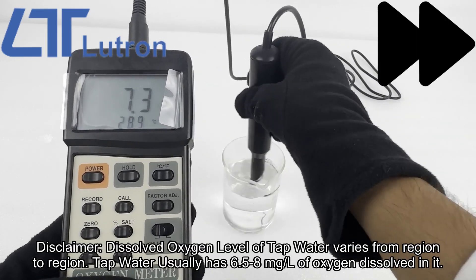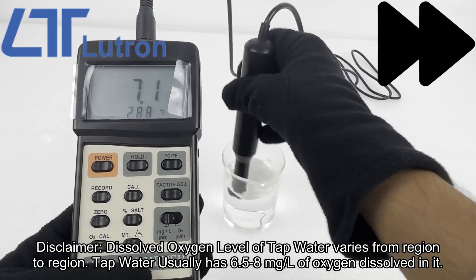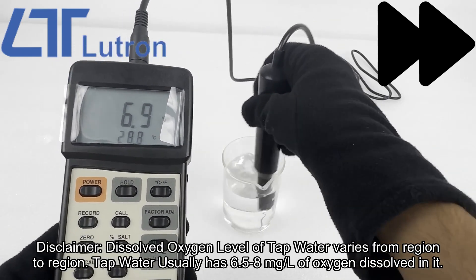Disclaimer: dissolved oxygen level of tap water varies from region to region. Tap water usually has 6.5 to 8 mg per liter of oxygen dissolved in it.